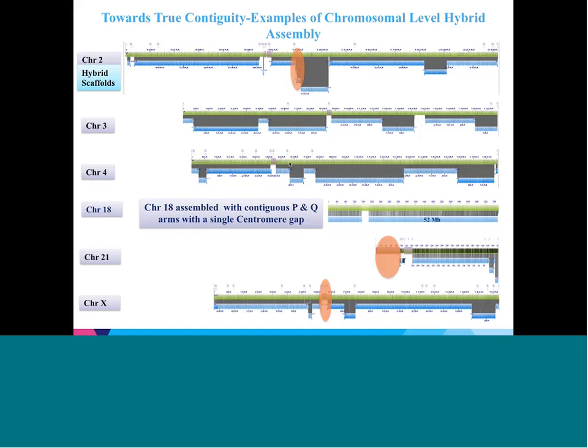When there's very large gaps, there's usually a reason why the reference has a very large gap in that region, either through low complexity, alpha satellites, etc. Even if we were to resolve that region, there's no way for us to see it in this image. So I just want to point out that these large gaps you're seeing here are just Ns in the genome, so we can't map anything to those. Not to draw alarm to anything. And in some cases, as you can see where my arrow is up here, we do go into the actual gap regions.